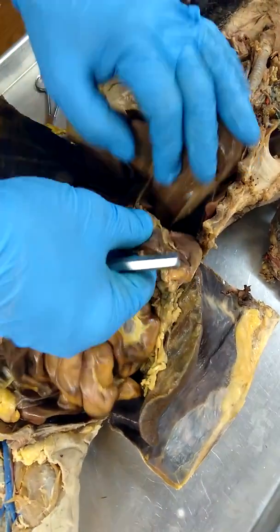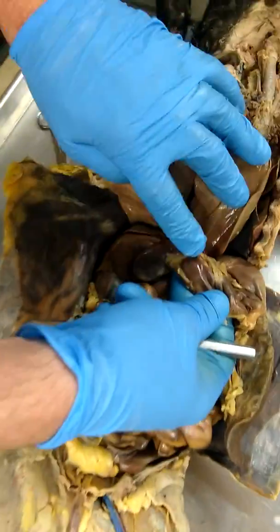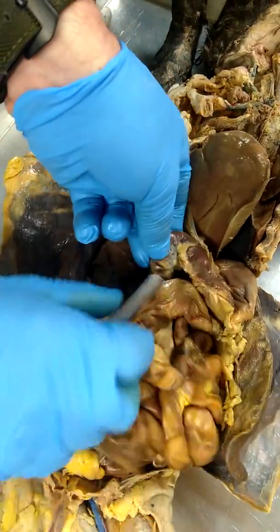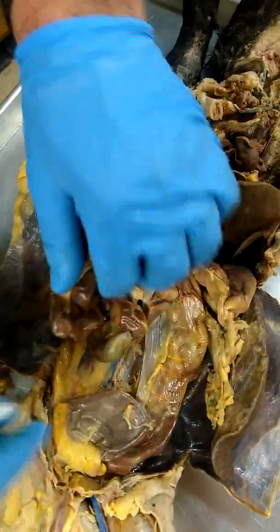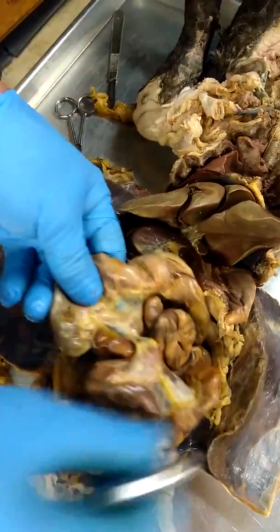Okay, when you get to the pyloric region of the stomach, you'll see that little line of fat right there. That little line right there, that's where the pyloric sphincter is located. And then the first section of the small intestine after the stomach, this is called the duodenum. I then work backwards and then go to the large intestine.